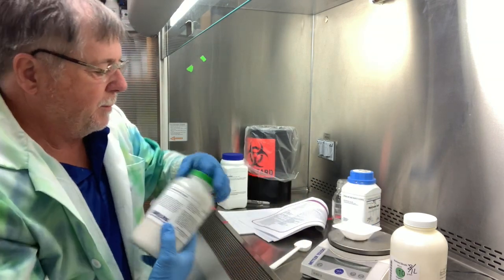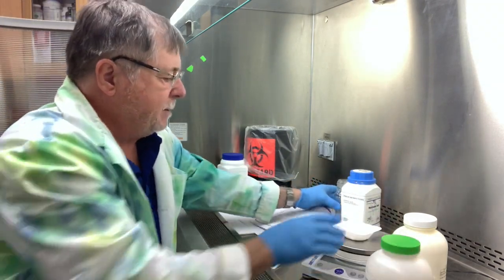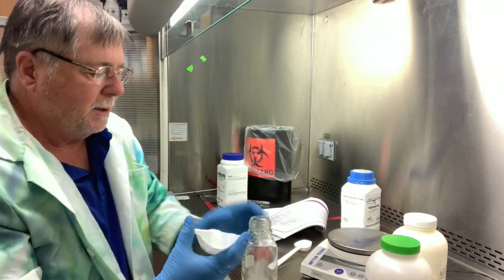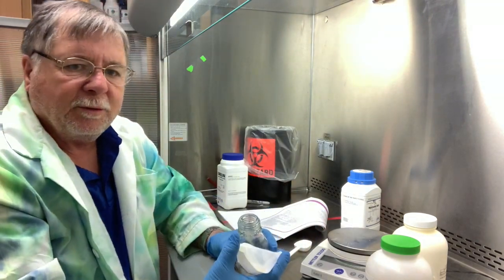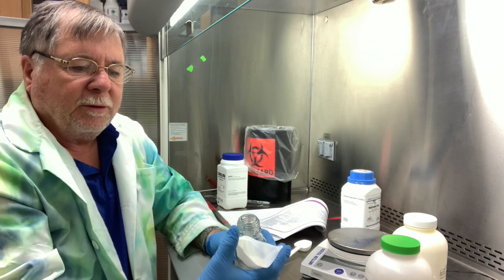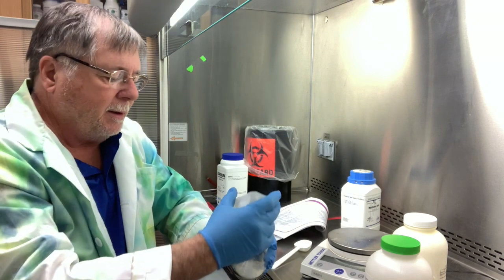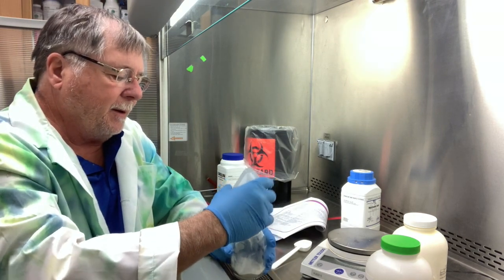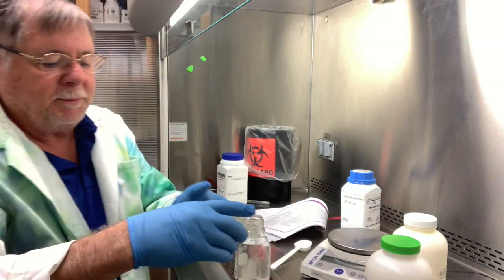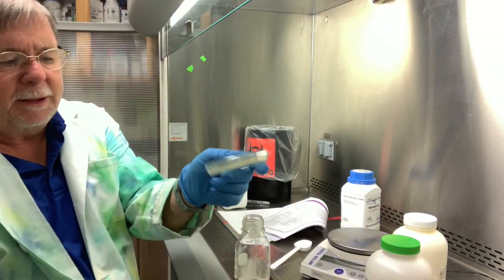Okay. There's 1.87, which will be fine. It's better to go a little bit extra than to go too light, because if you have too little of the agar, then when you use your inoculating loop to spread your bacteria on it, you end up tearing the surface of the plate. And here is our plate. This is a TS agar right here.